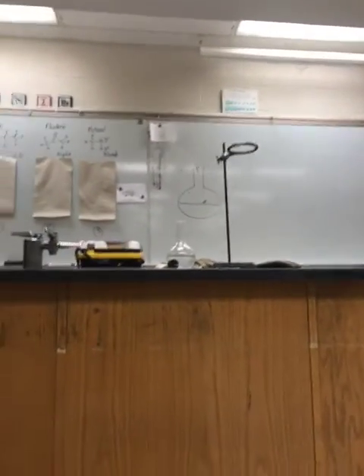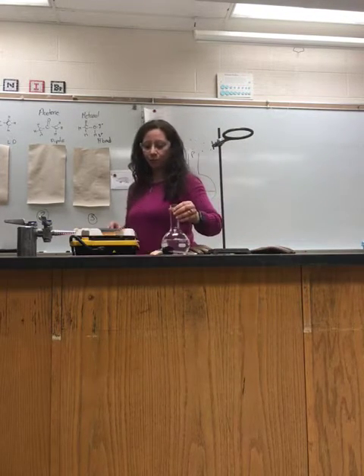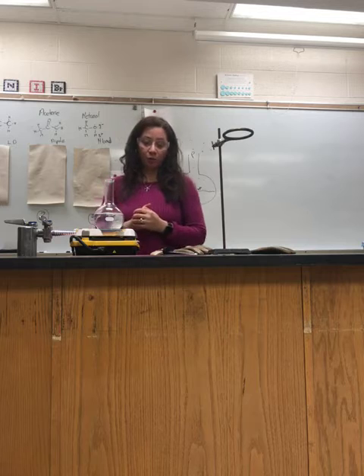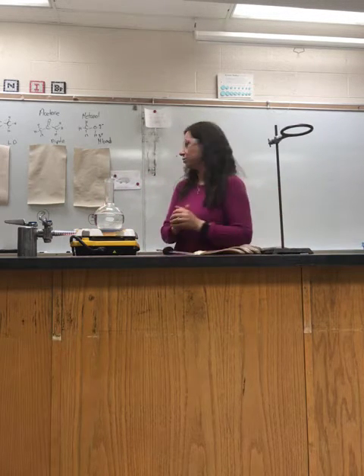Everyone, today we are going to boil water with ice. So I have some water in this Florence flask and I'm going to heat it up so that I can get it to boil. Remember, boiling is when the vapor pressure is equal to the external pressure.